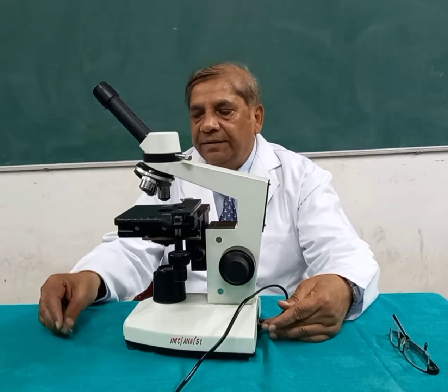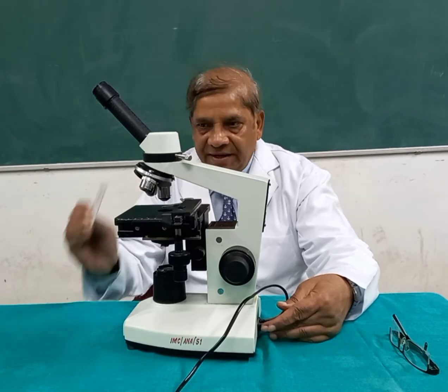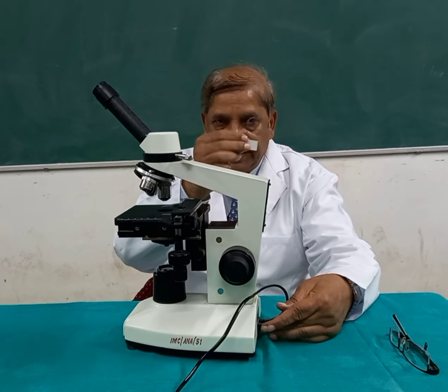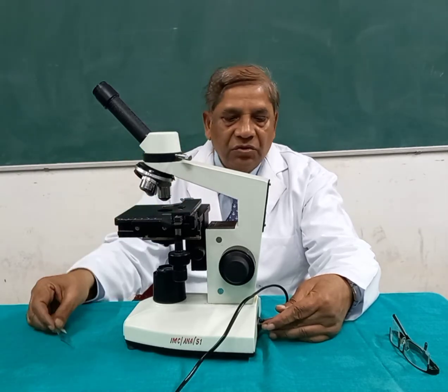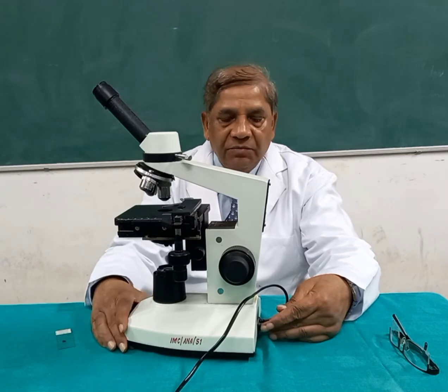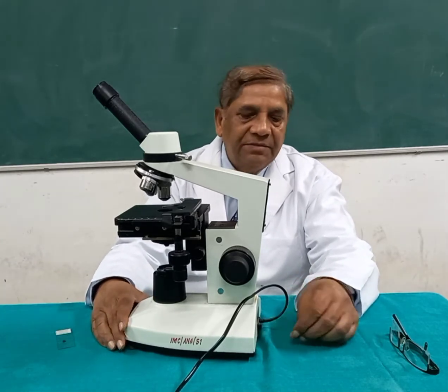Welcome back again. Now this video is on how to focus the slide. This is the slide where the stained tissue is there, and how we will see the image of this tissue under the microscope. So, how to focus the slide under the microscope. At the beginning, most of the students don't know how to focus a slide under the microscope.